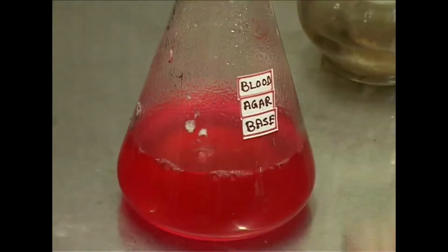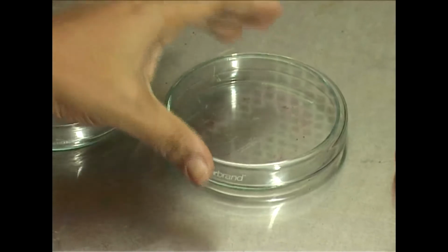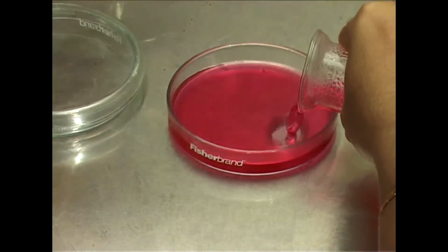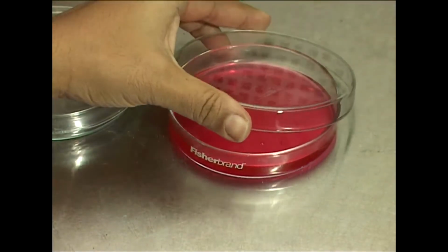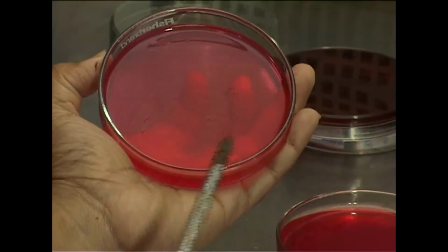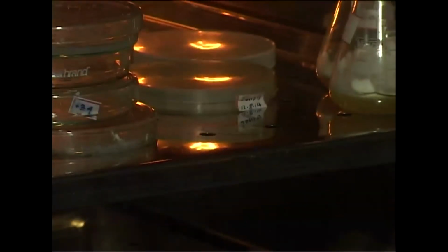And blood agar base is prepared by mixing pancreatic digest of casein, papain digest of soy meal, NaCl and agar. Blood is added to the sterile blood agar base, mixed properly and then poured on the Petri plate. Now, after solidification, we streak on the plate and then incubate it at 37 degrees centigrade.